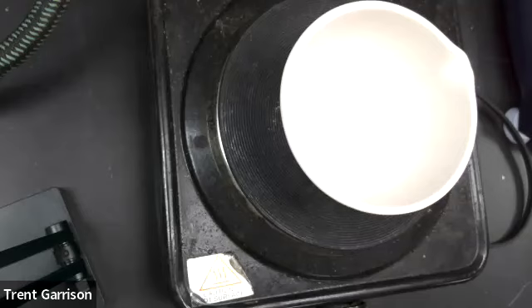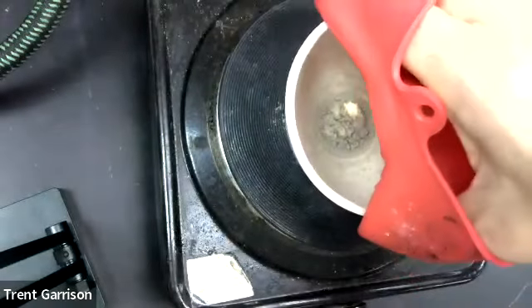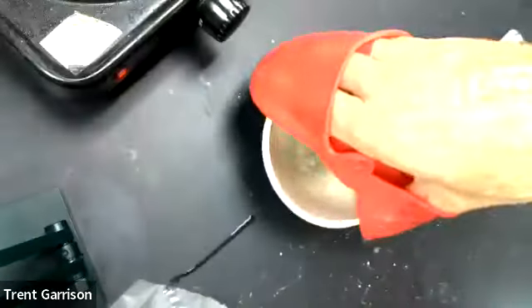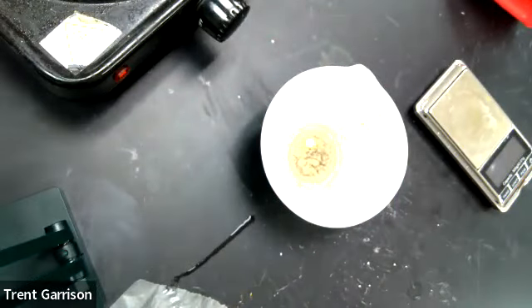You can see steam is starting. You can maybe hear that it's starting to boil. So we're getting progress. Okay, so what you can see now is that I clearly have changed over to a newer solid. It's in fact looking like it's probably burning. So what I'm going to do is I'm going to take this off of the heat. I'm going to set it down, let it cool for a few minutes, and then we'll get our final weight.